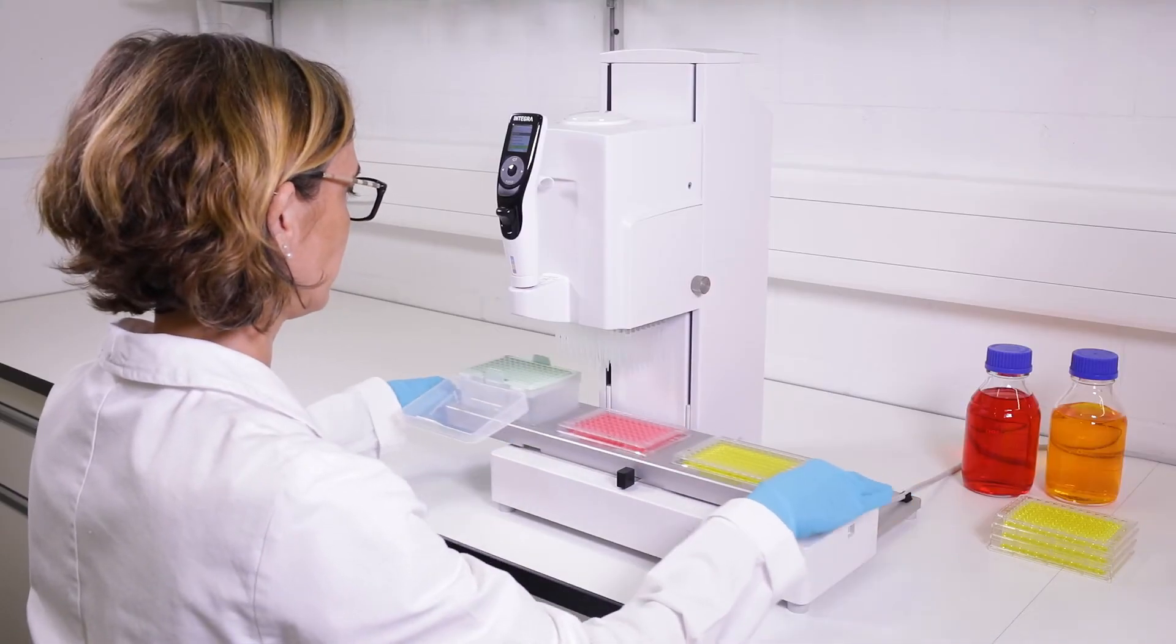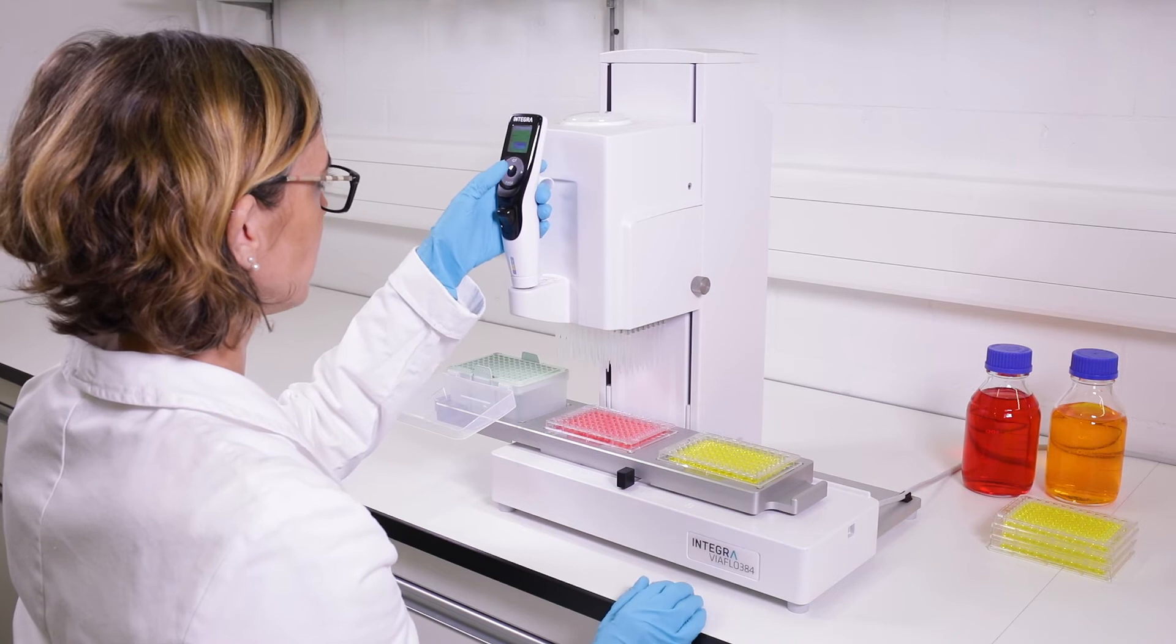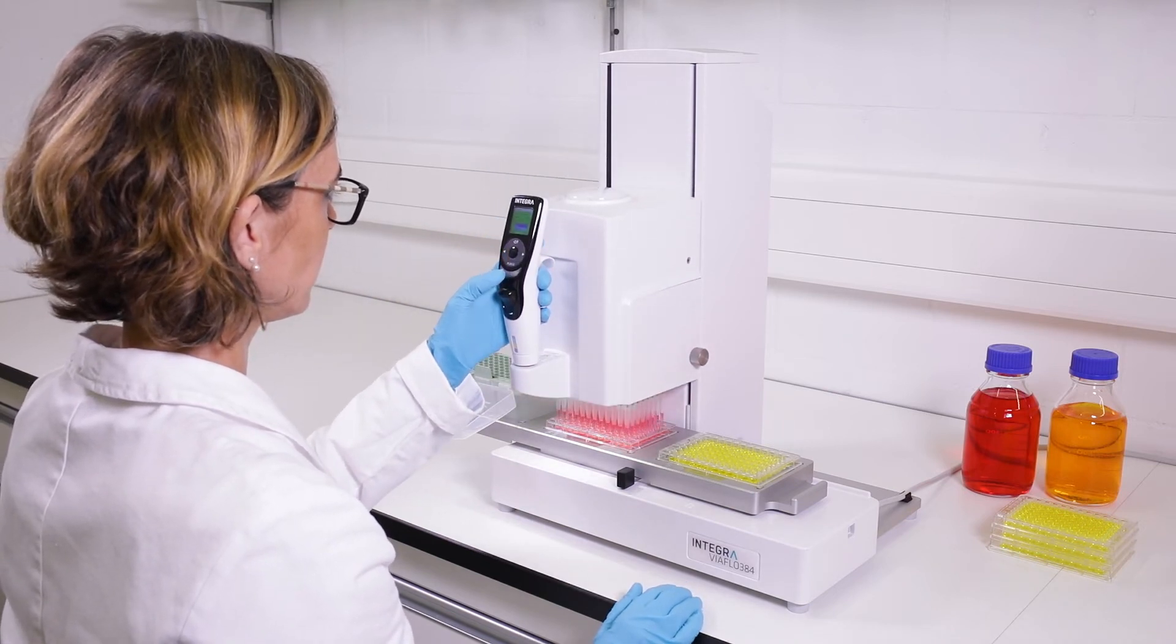A 3-position stage extends your working positions, to minimize the plate handling and optimize your workflow.